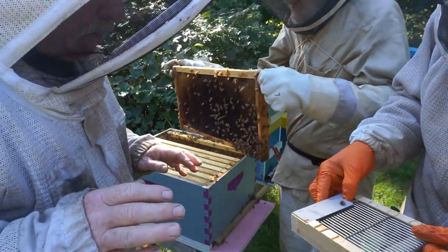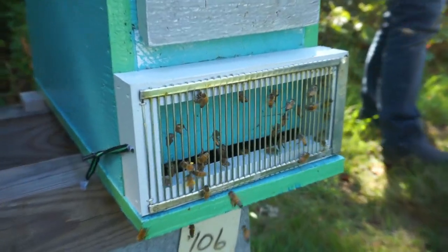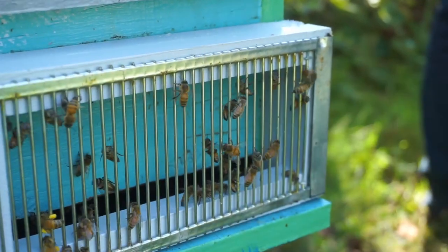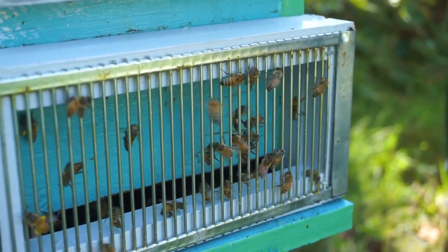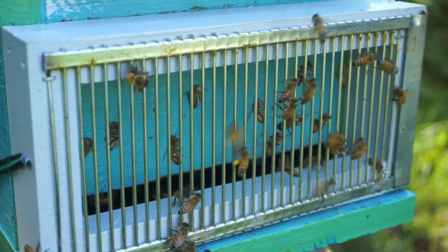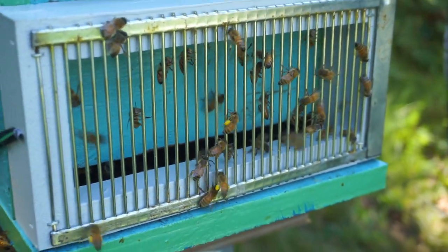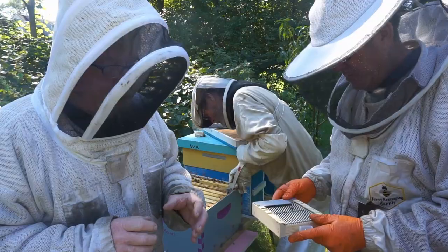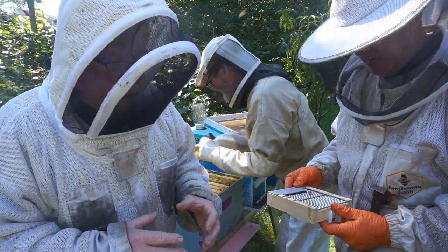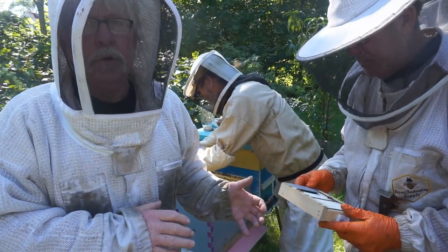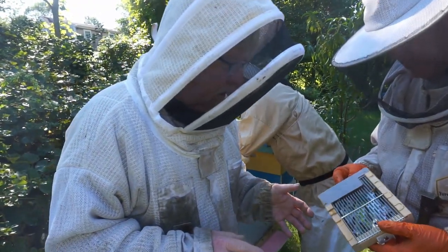It takes a little bit of a trained eye, but you want the largest thorax and the smaller abdomen. Because when drones emerge, their semen hasn't migrated yet, so their abdomen is larger actually when they just emerge than when they become mature. So that's one of the things we try to look for.